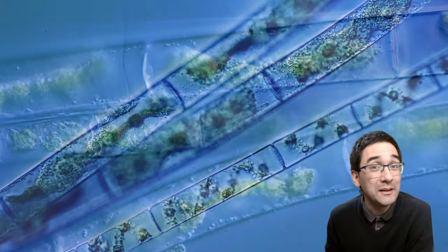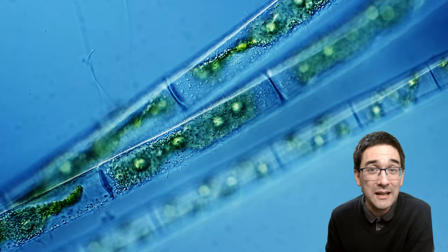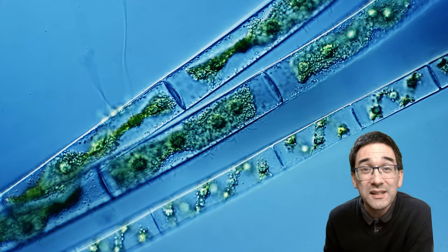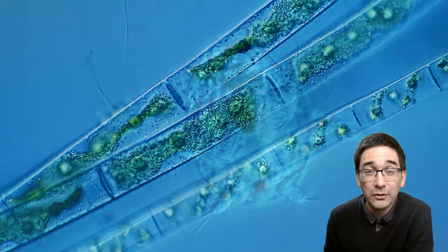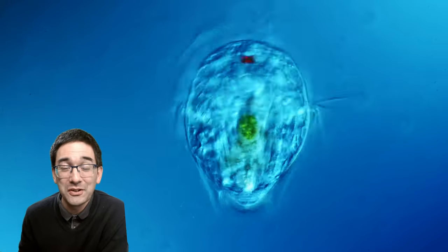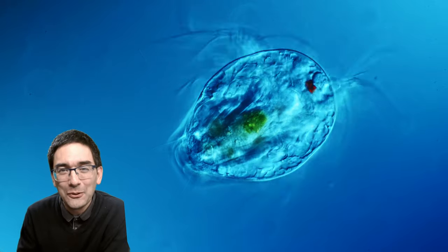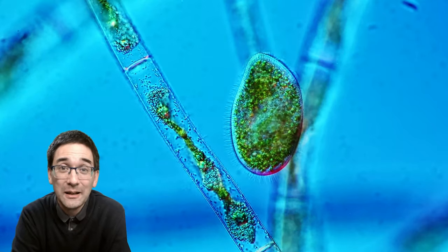These algae are present in abundance in the pond, but they're not always a good sign — many of them like to reproduce when there are too many nutrients in the water, which can indicate over-fertilization. And of course the Nauplius larvae — I like those little critters a lot because they're transparent, which allows you to look inside the body of the organism.